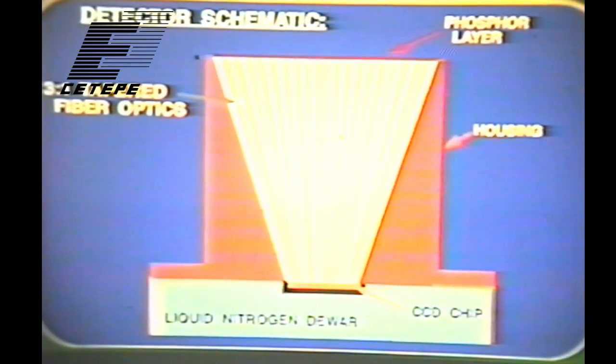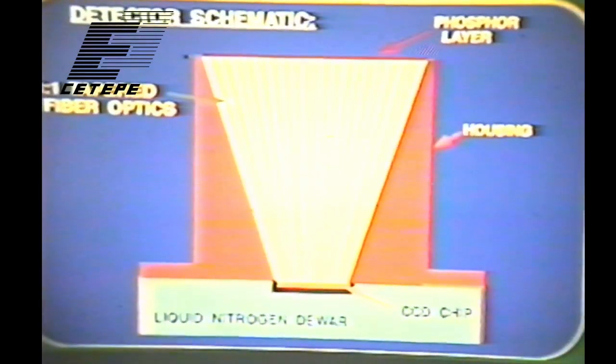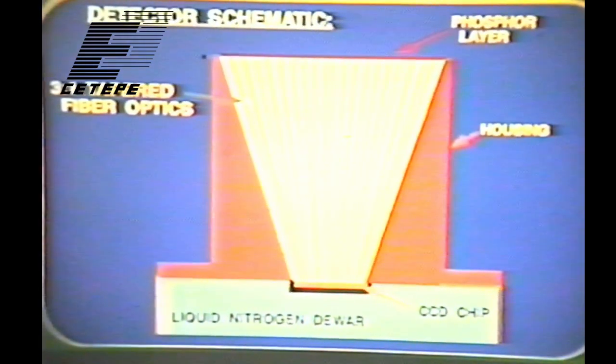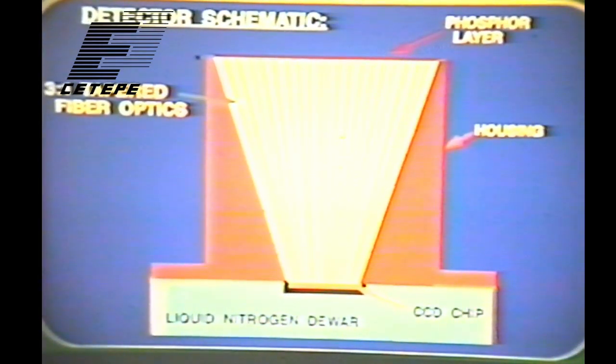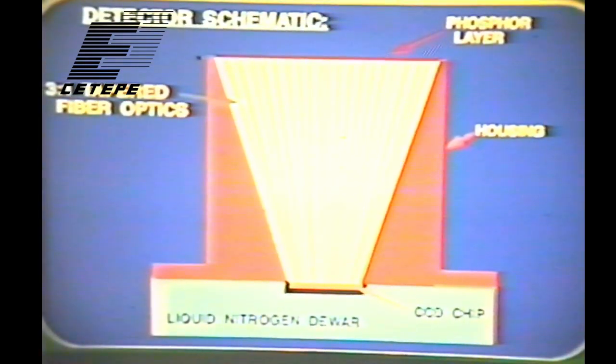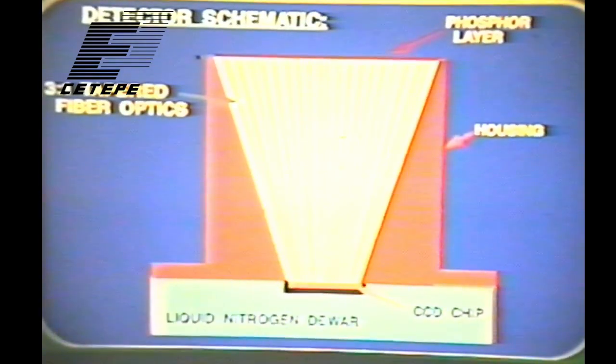But especially the bigger this ratio, like 6 inches to 1 inch, is very, very challenging. I don't know if they can even achieve this. More typically, it'll be a 2 to 1 or 3 to 1 taper. But in this process, sometimes fibers break, or they don't transmit light anymore. So there are problems with this, especially for CT.